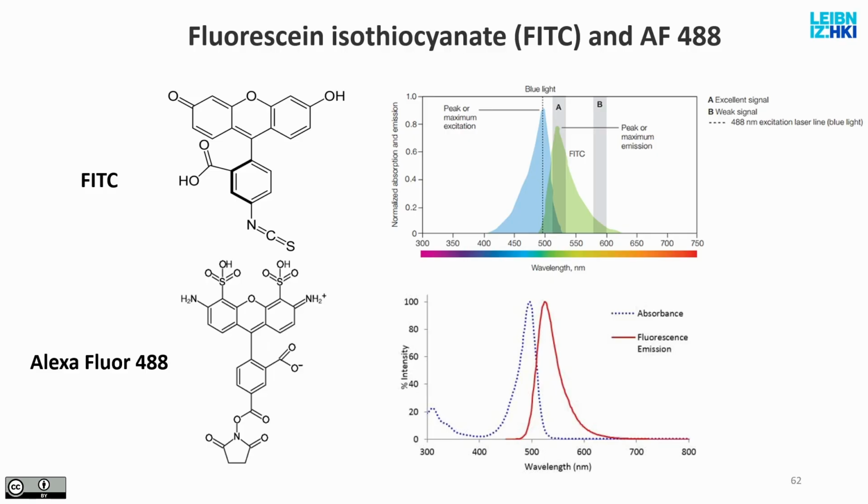If you use 600 nanometer red light, it's not going to get excited by it. But if you use 480, 490, most of those photons will be absorbed by the FITC molecule. So you look at this spectrum and you say, okay, this is how I choose my excitation wavelength. I have a light, an arc lamp, or a laser, which is illuminating in this wavelength range.